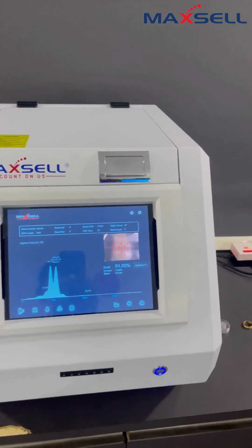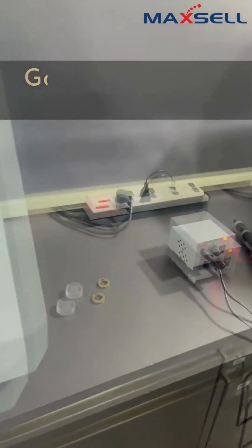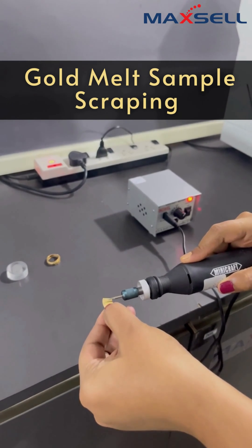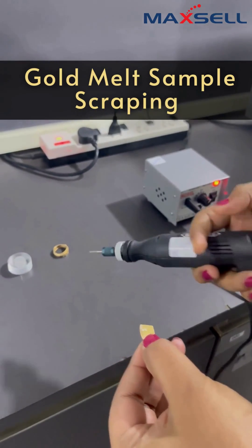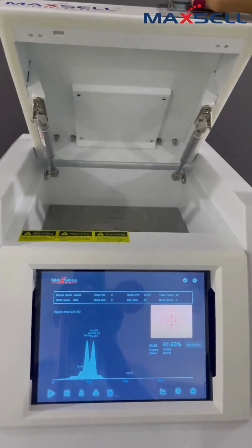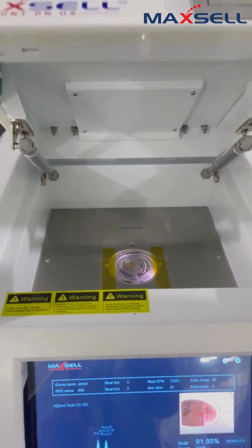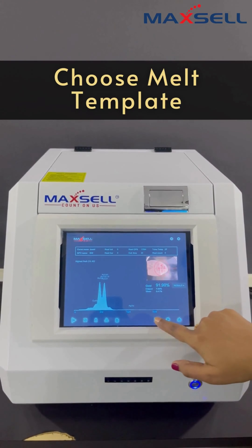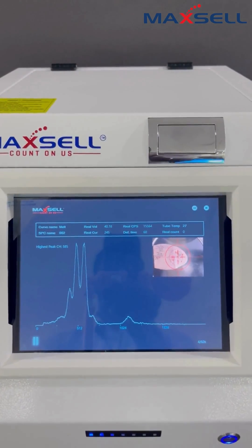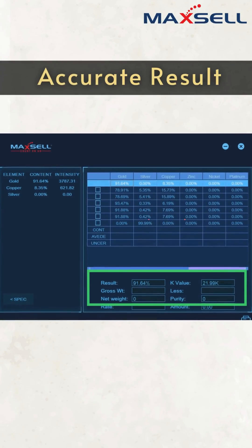Now we are going to test the melted sample. Scratch the sample mainly. Take the scratched area in the center of the chamber. Choose the melt template and test for the result. Wait for the test to get complete. This is the result of the melted sample.